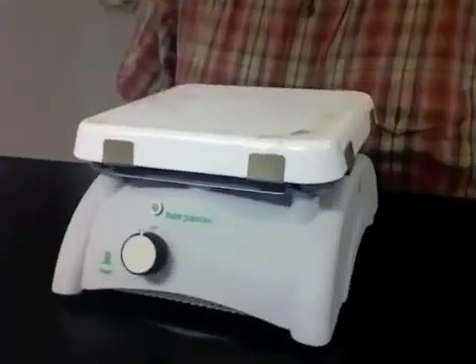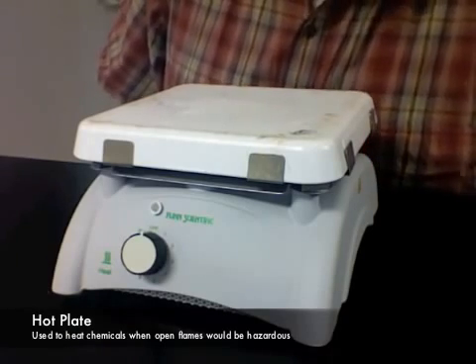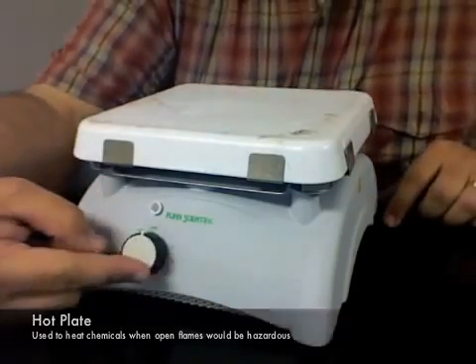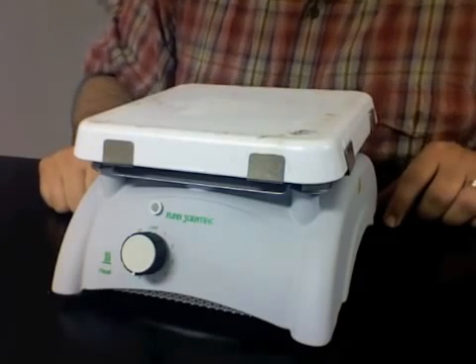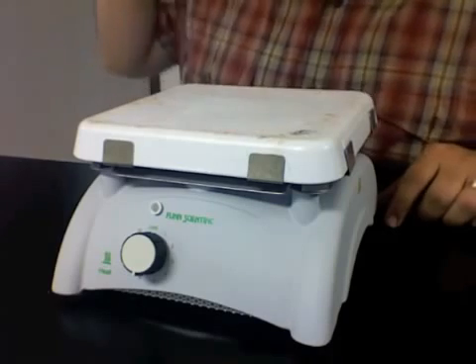This, ladies and gentlemen, is a hot plate. No, we don't use it to cook grilled cheese. We use it to heat chemicals. It simply has a little dial. You turn it on, a light comes on, and you heat the chemicals. And what should you remember when the light is on? Don't touch the surface. Ow!